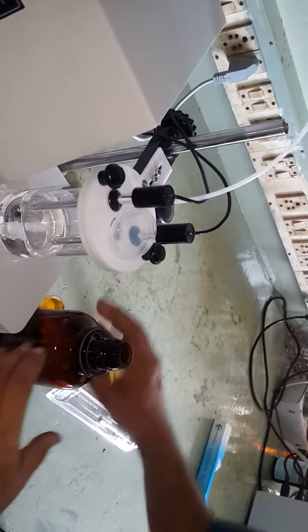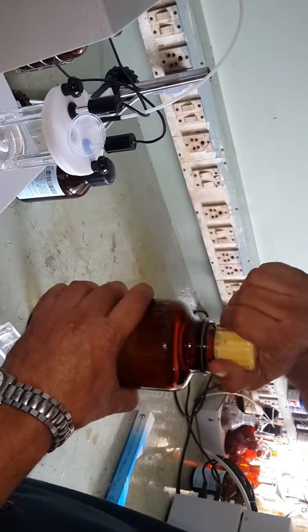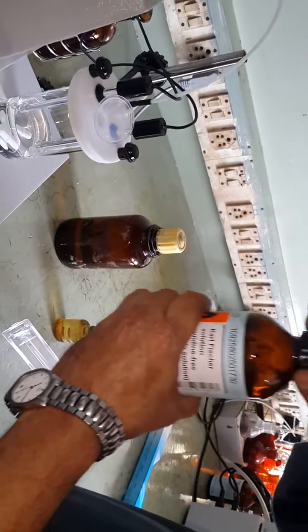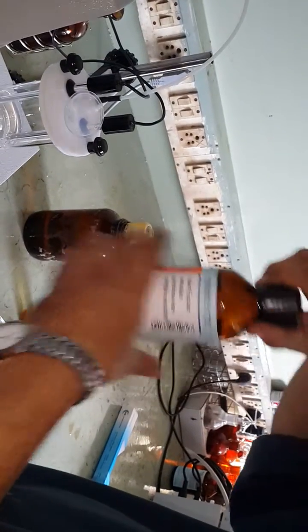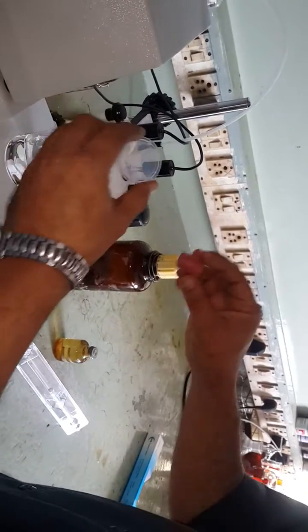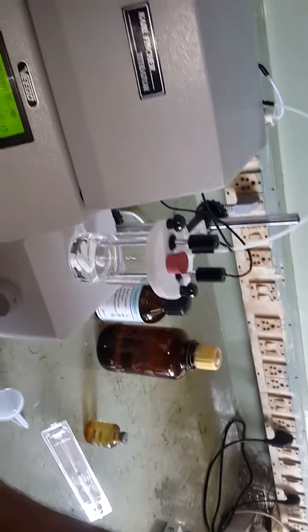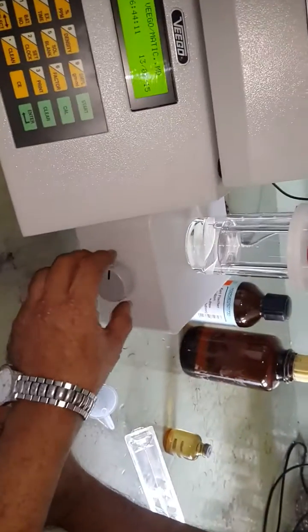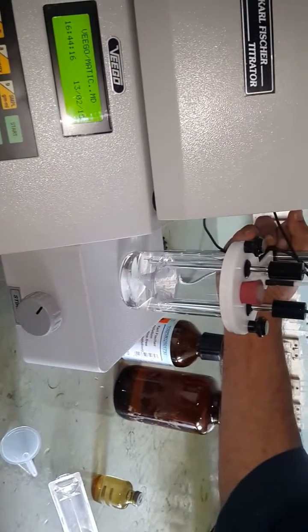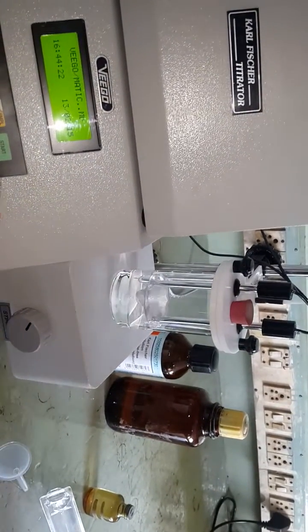All these chemicals are highly hygroscopic, so after using any chemical just close the bottle immediately. Similarly, Carl Fischer reagent is also highly hygroscopic as it reacts with water, so keep all bottles closed. Remove the funnel, close the stopper, and start the stirrer — adjust the stirring so the methanol is stirred gently.